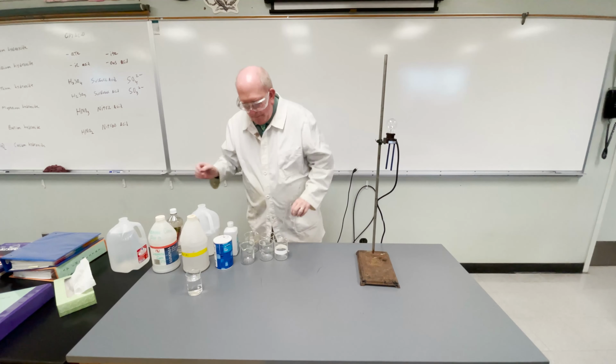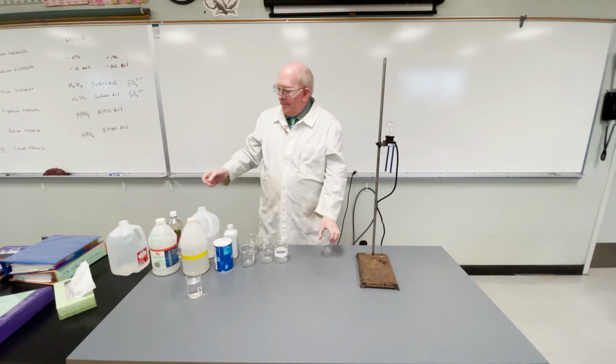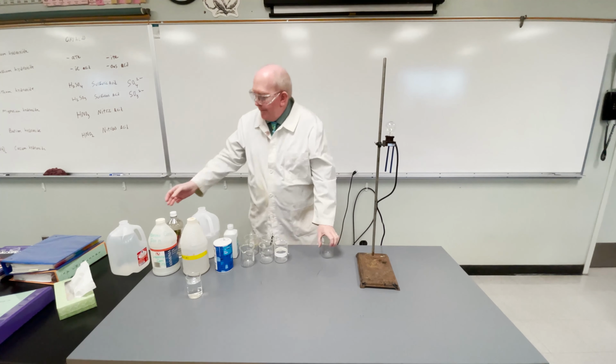So, take a beaker here, some more of this distilled water, which you already know does not conduct. Pour some in. Some is a great word in chemistry when you don't know how much you want to be making reference to. And I'm going to add a whole bunch of sodium chloride, okay?